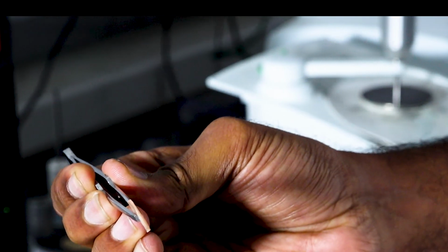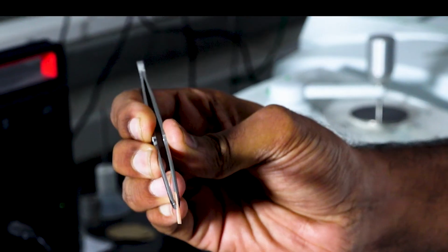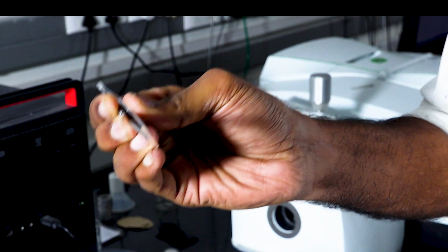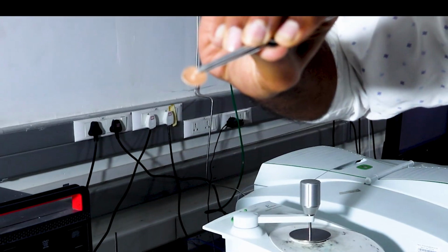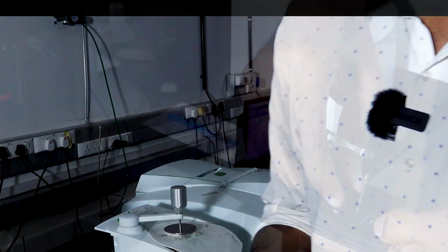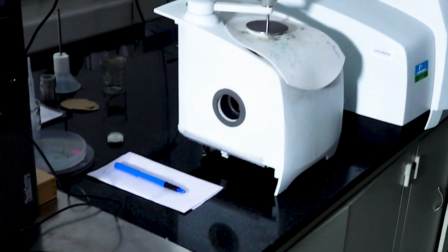When you have a powder sample and you want to do FTIR, since you cannot just sprinkle this sample in the beam path, we need to make a pellet out of it. So normally we will mix with potassium bromide, and using a pellet die and a pellet press, we will make a pellet in this form, and this pellet can be placed in the holder and we can do the analysis.